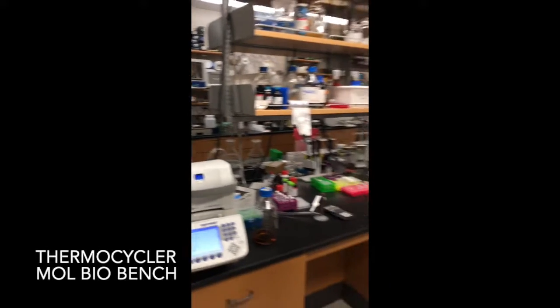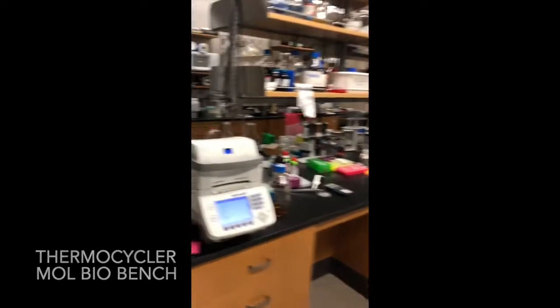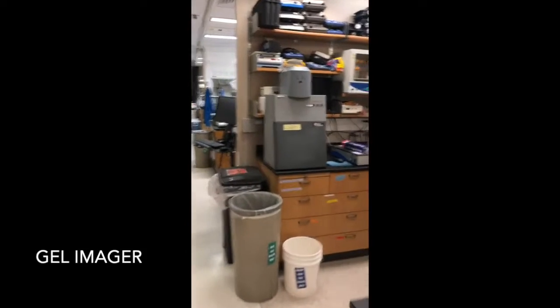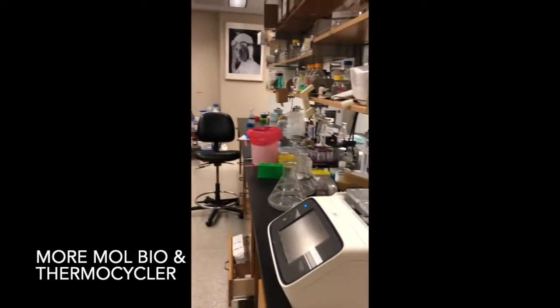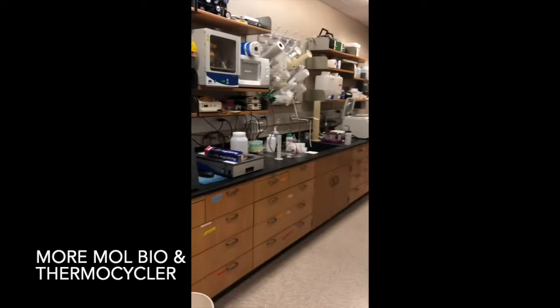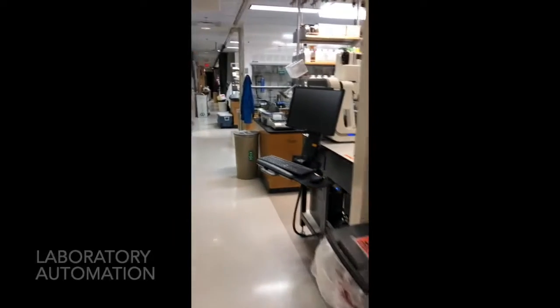Just walked past our laminar flow cabinet. We have a PCR thermal cycler. This is what the molecular biology benches look like in general. Here's another view. Again all the typical stuff that one would find in a lab for molecular biology.